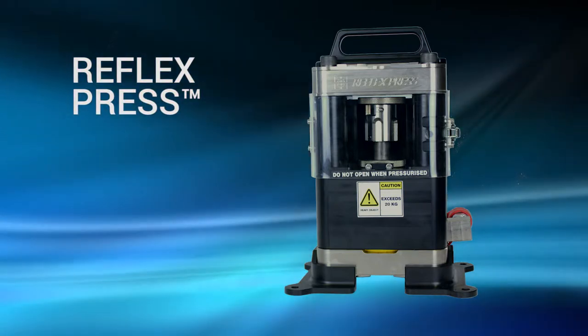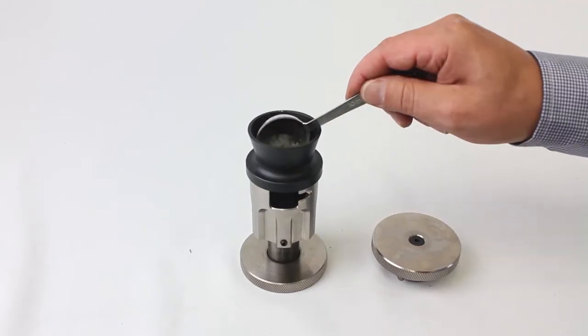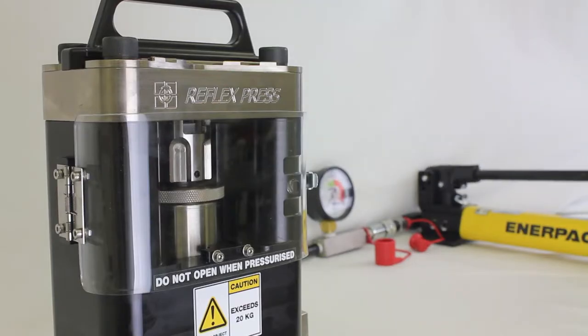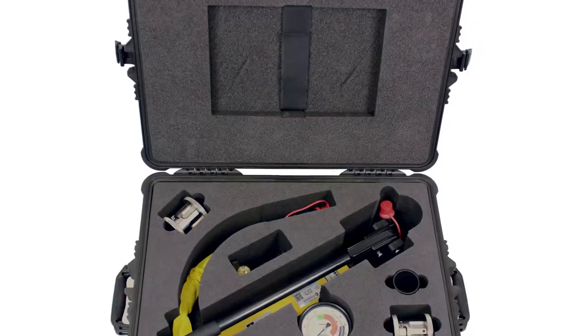The Reflex Press is a high-pressure hydraulic press designed to produce a densely packed, homogeneous sample puck that can be measured by XRF without the signal attenuation resulting from the use of a film coating or pole packing.